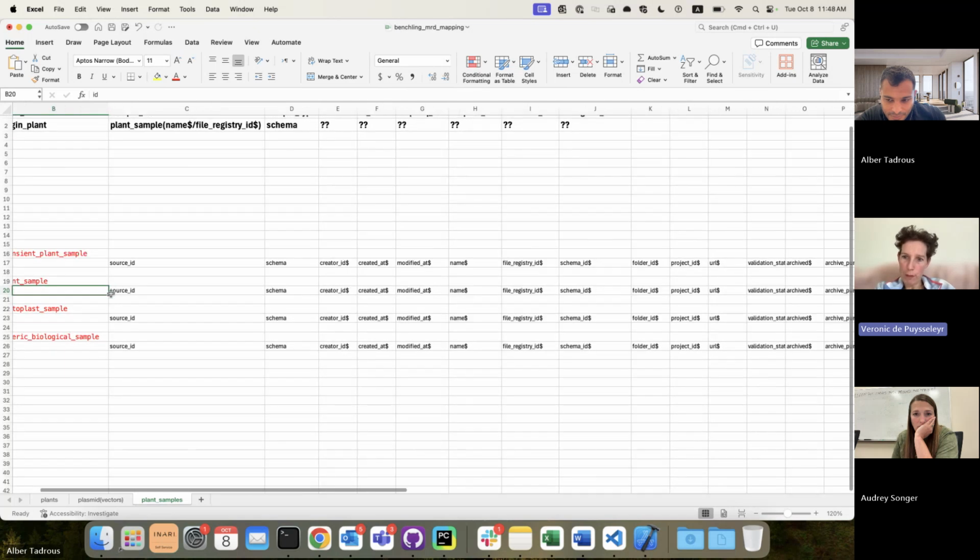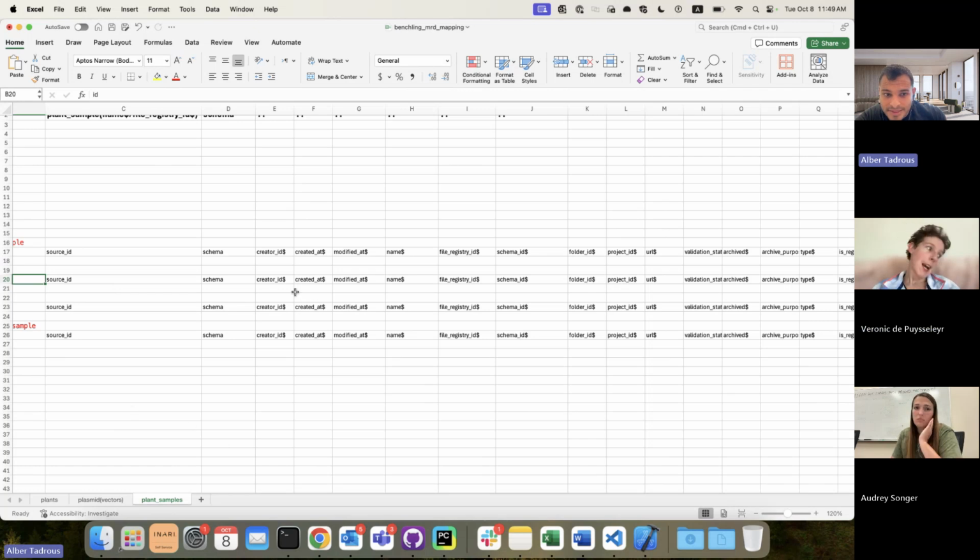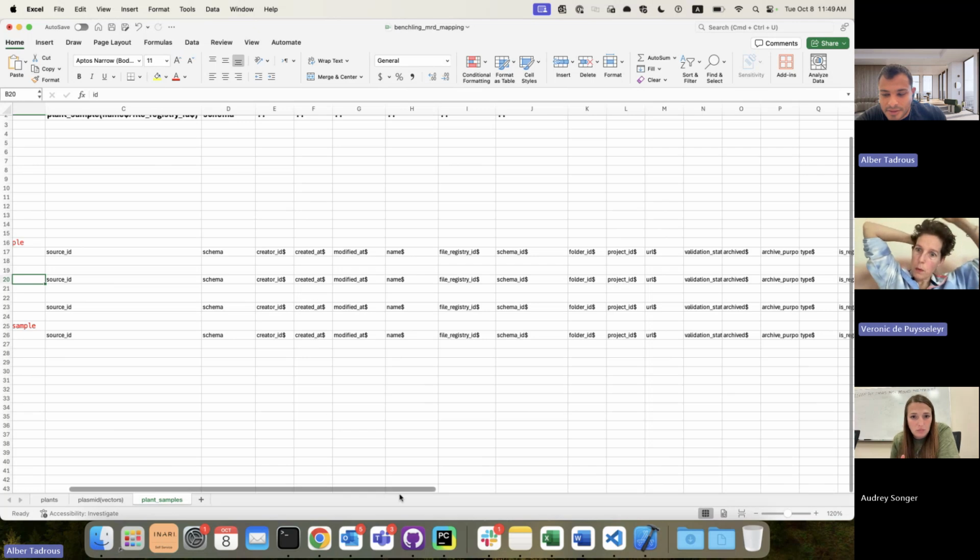There can be additional information on the plant sample. If you take a plant, whether it's a leaf or a root, where is this in MRD, or is this information not being copied in MRD? No, we don't have it right now. All of this phenotypic information on a sample, you will not find in MRD.